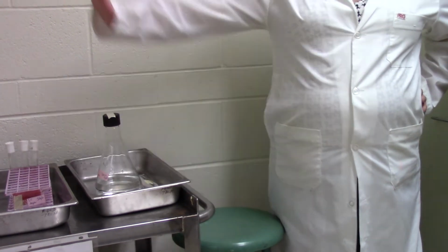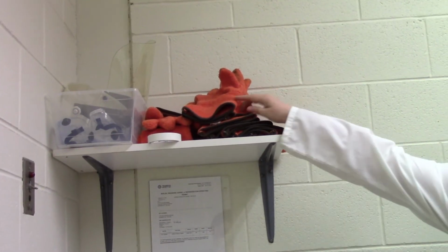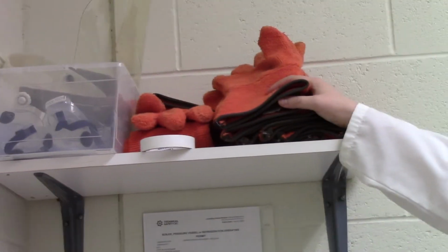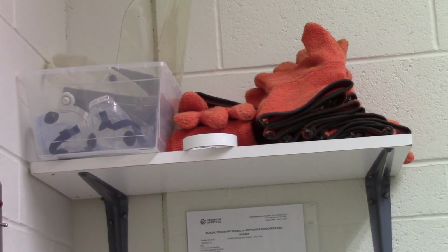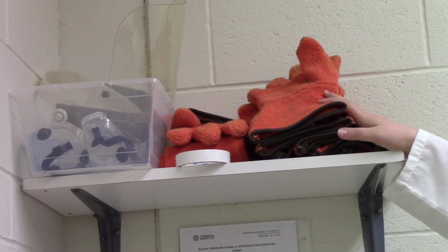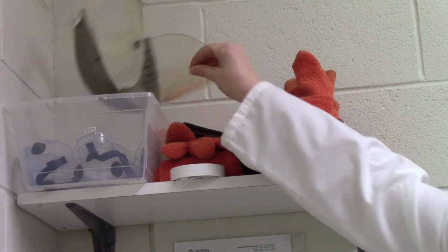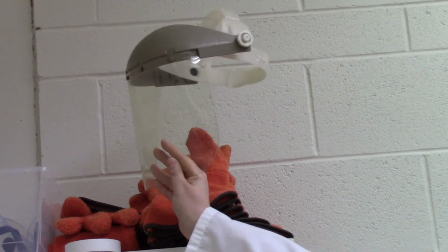Above this cart, we have some important safety materials for using the autoclave. So we have our heat-resistant gloves. You're always going to want to wear these whenever you're unloading or loading the autoclave. Even though these are cool to the touch, the inside of the autoclave is very hot, so always wear the heat-resistant gloves. The autoclave can sometimes also have excess steam inside of it, and because of that, we always want to make use of a face shield while loading and unloading the autoclave. So I'm just going to go ahead and put this one on right now so that I'm ready to go.